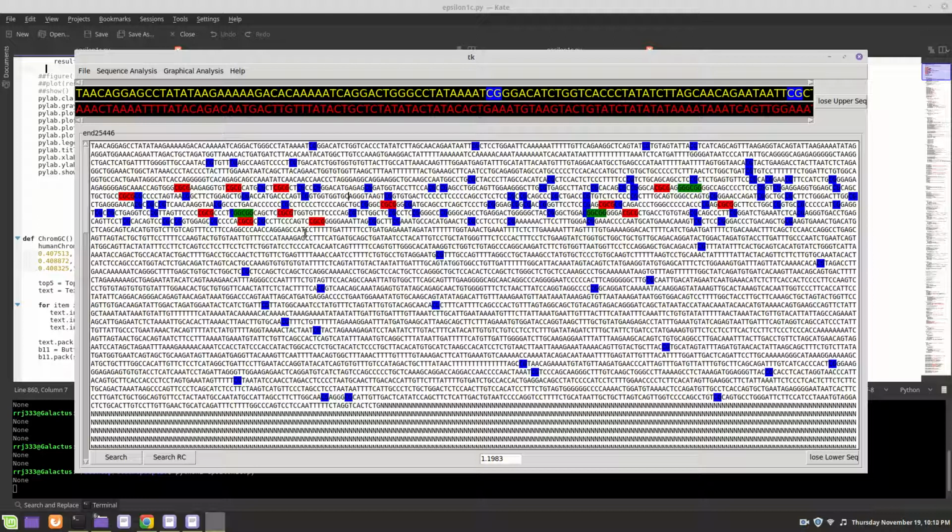But the idea is we can begin to search for certain things, and this would give you clues as to what to look for, maybe in RNAs that are related to this sequence, and you want to know, well, what do they start with? Maybe you're having a problem making primers or something, and you would like to know, well, am I inside this sequence or not, to make a primer to pull it out and do PCR.